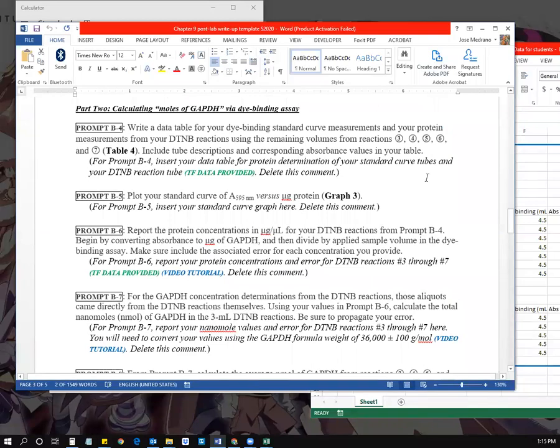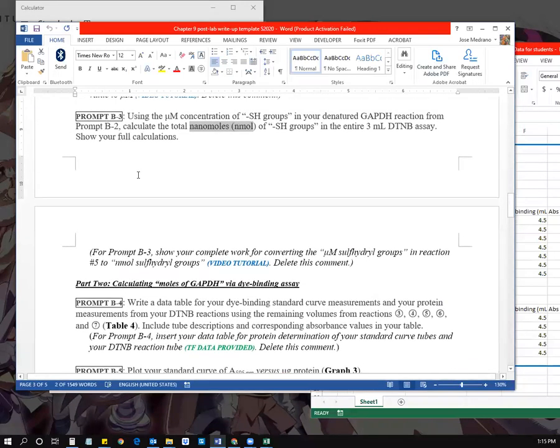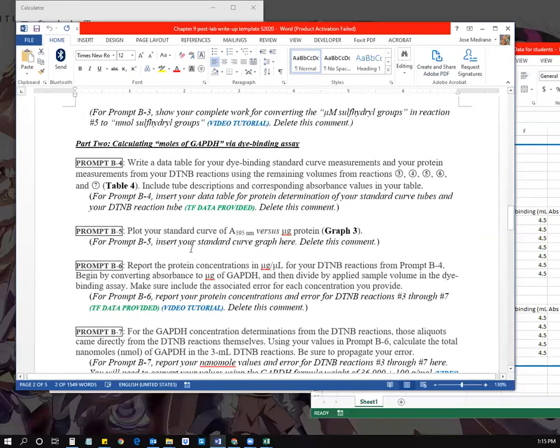This video tutorial is going to show you how to go through your dye binding assay TF data that was given to you in Blackboard so that you can end up with one final value of moles of GAPDH in the DTNB reaction, which you're going to use in conjunction with your answer from prompt B3 to figure out how many cysteine residues there are per GAPDH molecule or GAPDH protein.